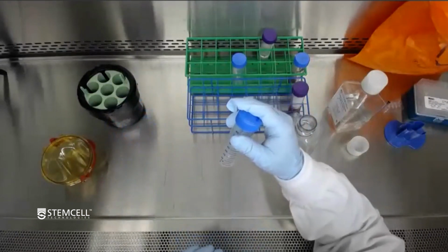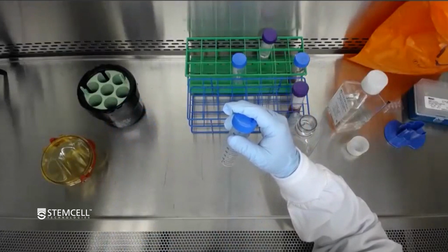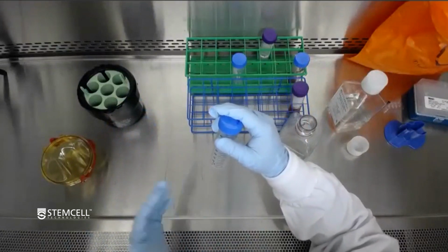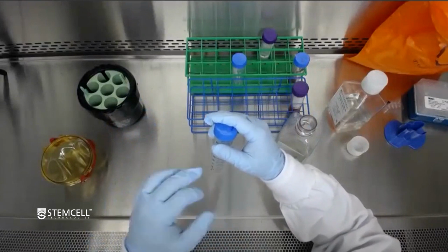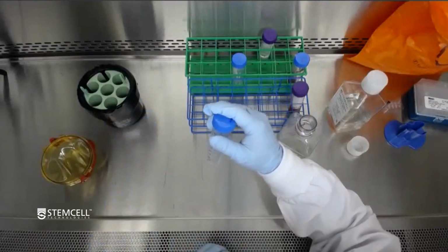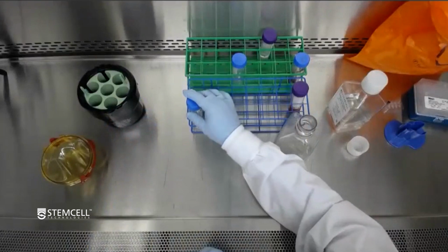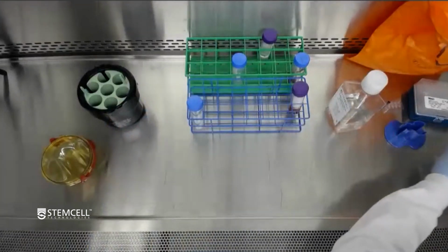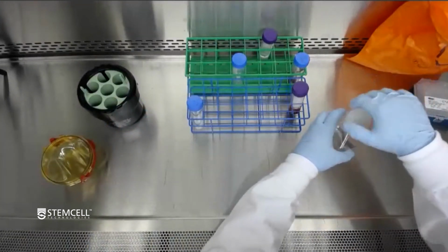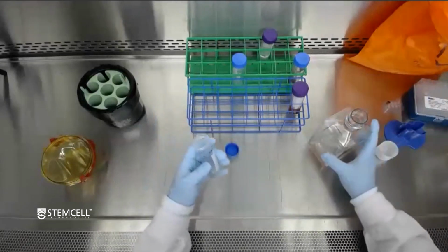Be aware that if you are particularly concerned about platelets, you could do a slow spin. So that would be 120 times G for 10 minutes with the brake off. However, what most customers do, unless they're concerned about platelets, is that they will re-top up with buffer, which is your PBS plus 2% FBS, and respin at 300 times G for 10 minutes with the brake on. So let me proceed with that. And then we'll finish that last spin.